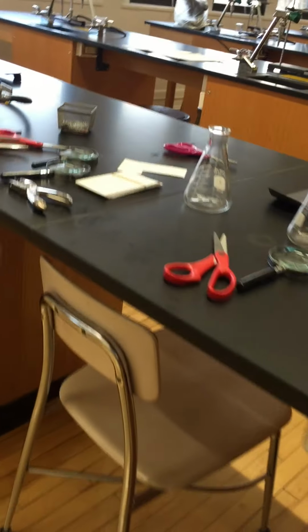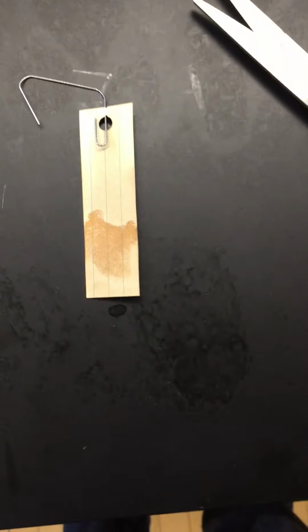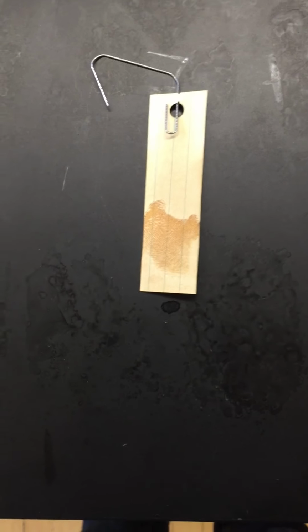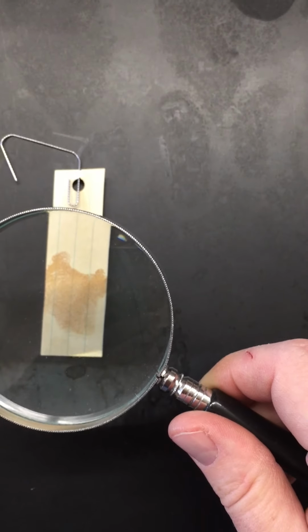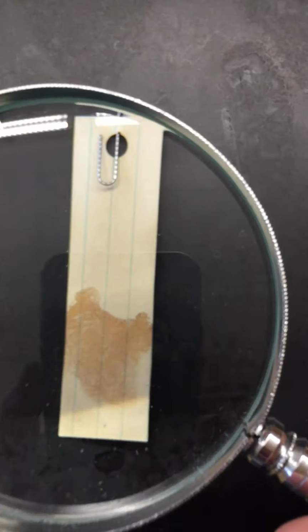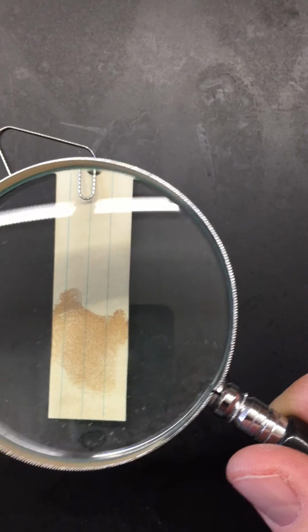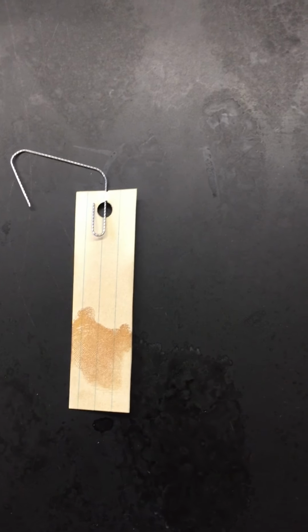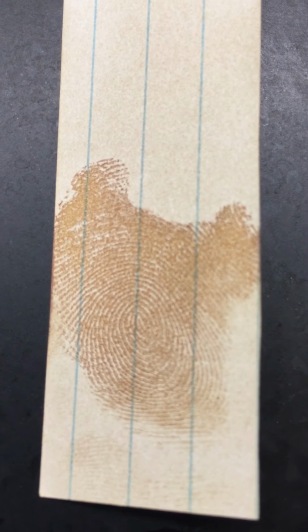Now let's bring it back over and take a look at it, because I want to be able to identify what type of fingerprint I have. Is it a whorl? I don't know if that's going to work on the camera. Well, this part's not working very well, but that's essentially what it is. I can see it with my own eye here. Let's see how close we can get it. Oh yeah, it does come out pretty well. Here we go. Okay, so that was a good one.